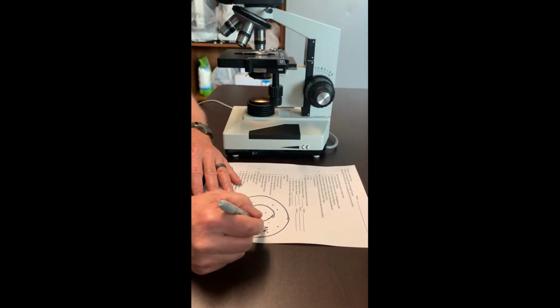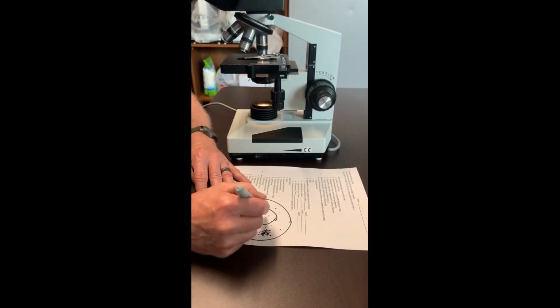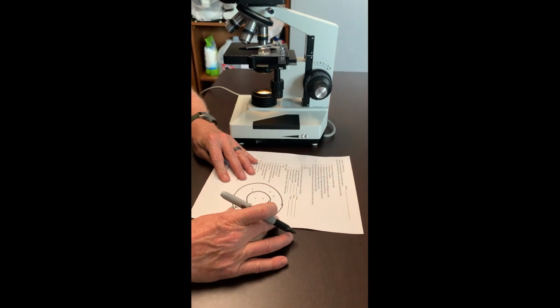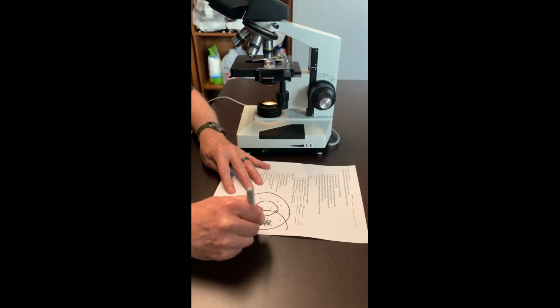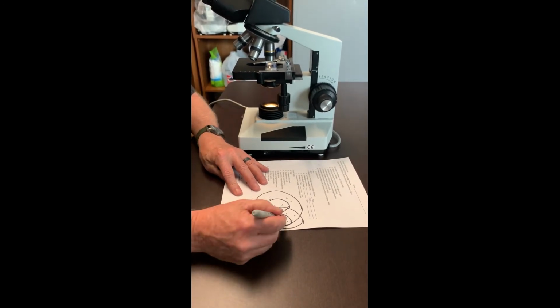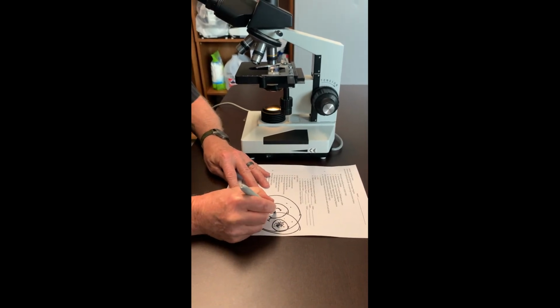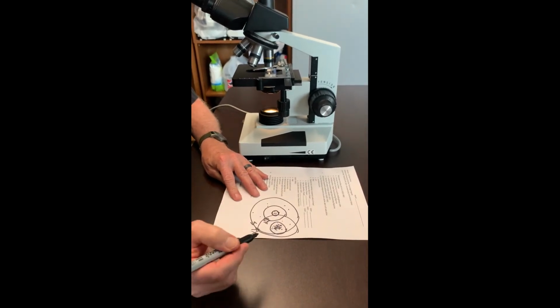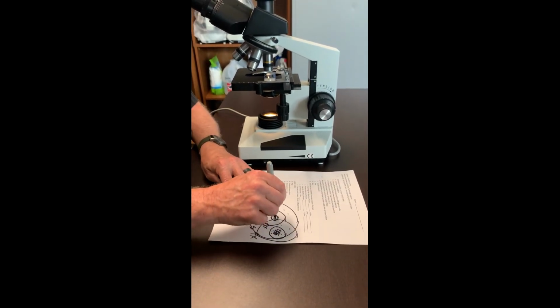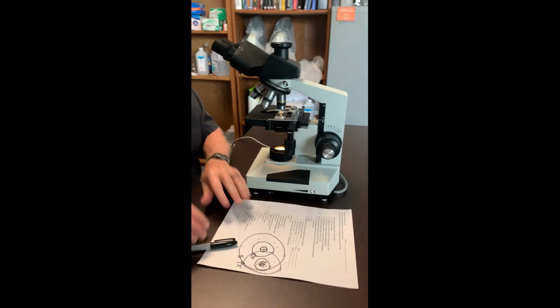So every time you want to go up, you want to center what you're looking for. If I moved my slide and now it's in the center, when I go to the higher objective, it's still in the center. And then my highest objective is going to be even smaller. So you always want to get your object in the center of your field of vision before you move up to your next power. If that made sense.